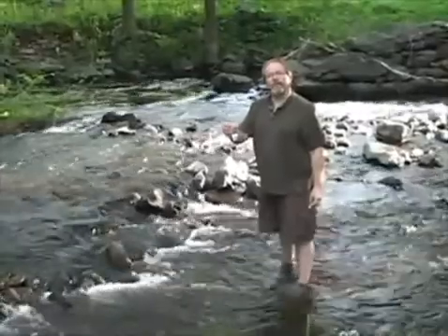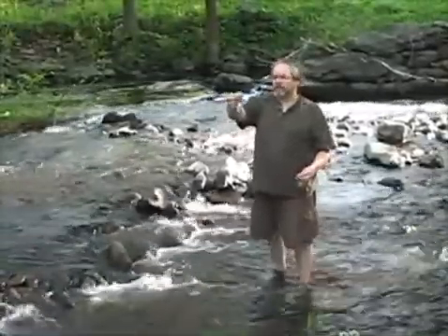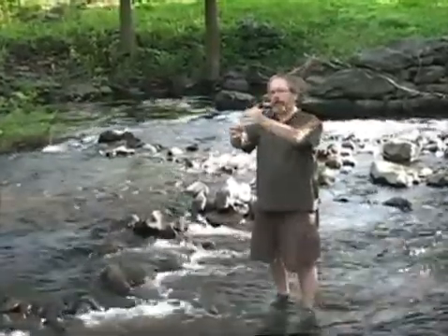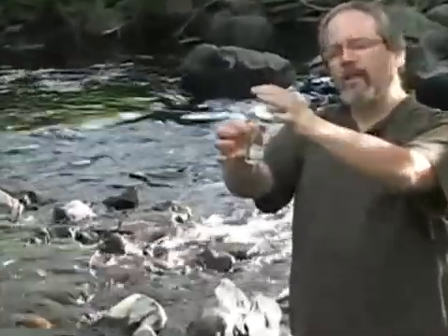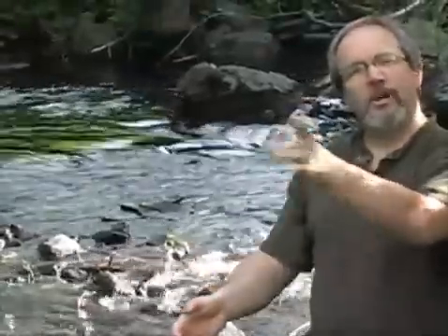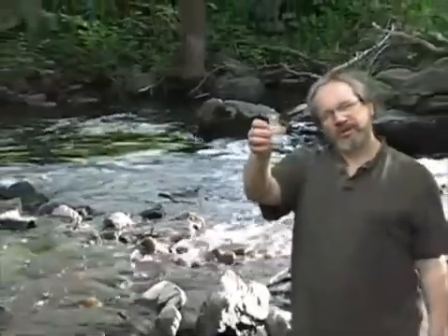More, or are you good? I think that's good. Once you've got that bottle full, what you're going to do is to take your stopper, you hold it about a 1/4 inch above, seated in place, and just drop it in. That will displace the extra water that's in there. Just dump off the excess, and that bottle's ready to go for some additional testing.